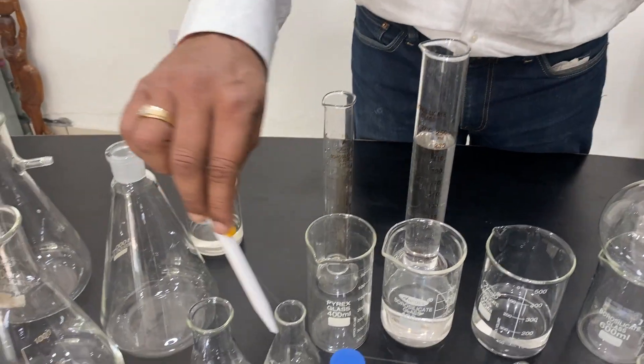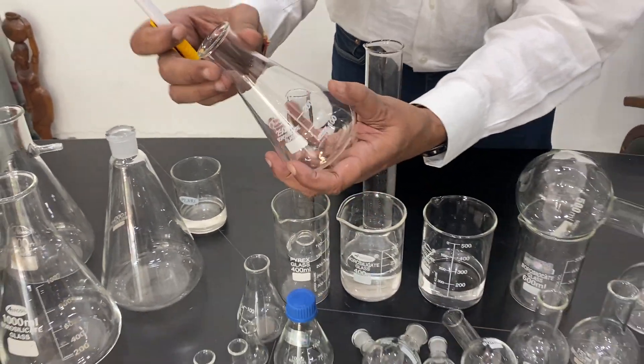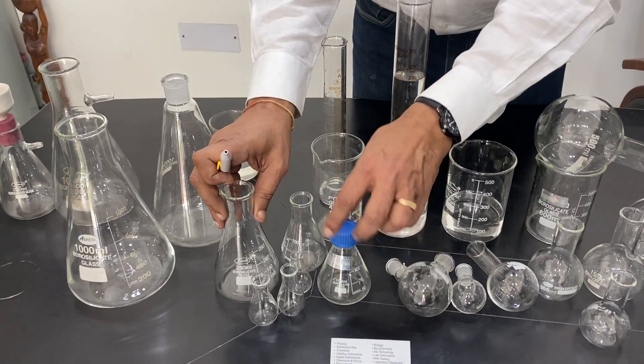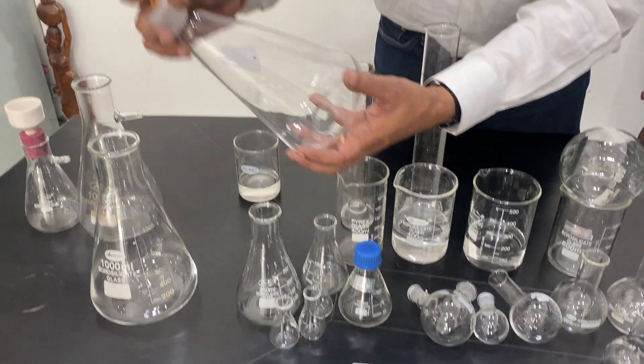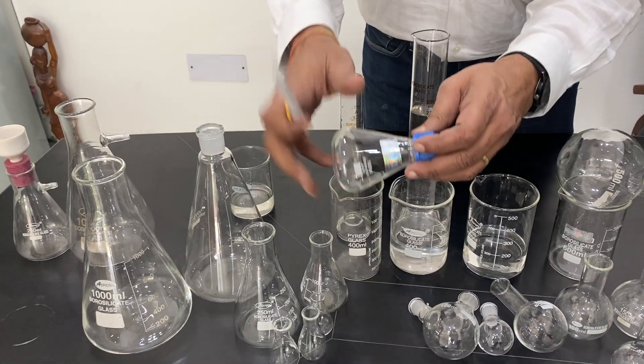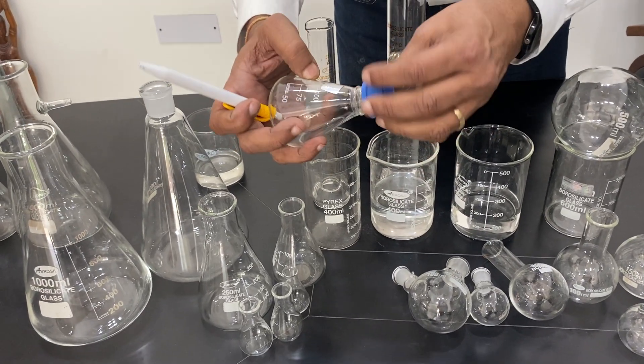Next comes the conical flask. It has a conical bottom, flat surface, rim, and approximate graduation on the side. This comes with a standard mouth to put a stopper on it, or alternatively with a screw cap that has a gasket inside for a leak-proof seal.